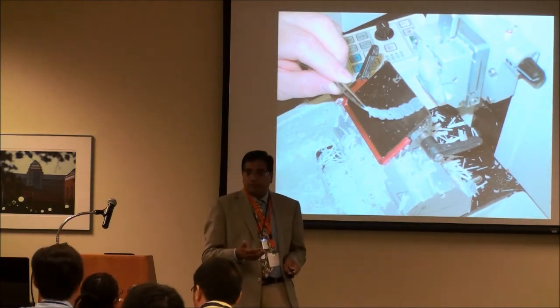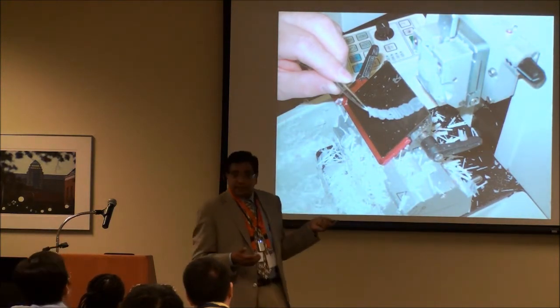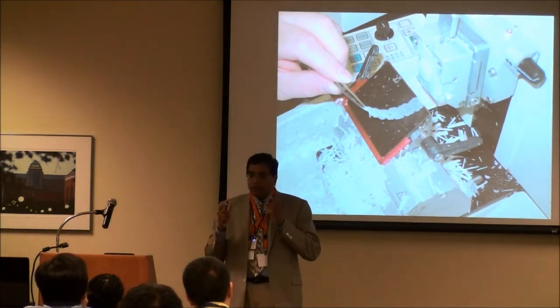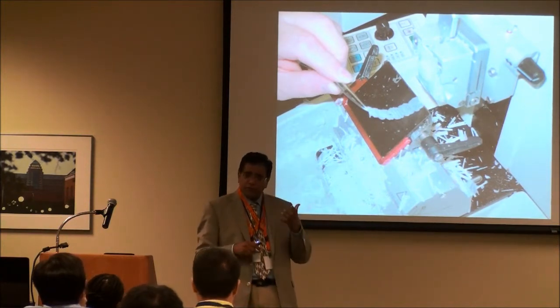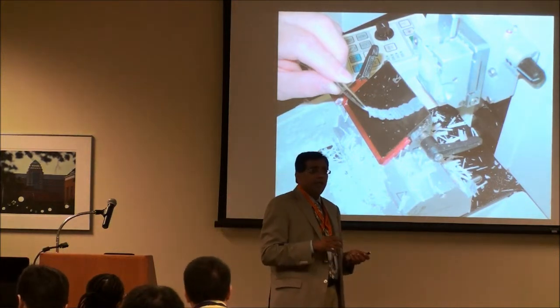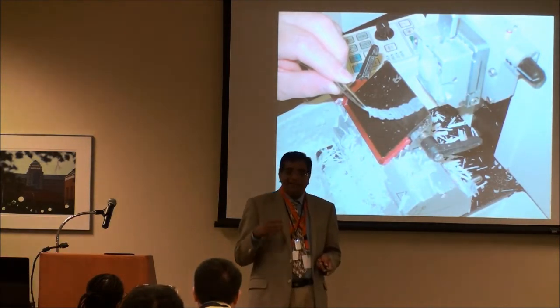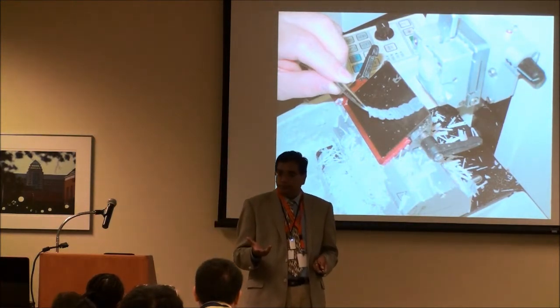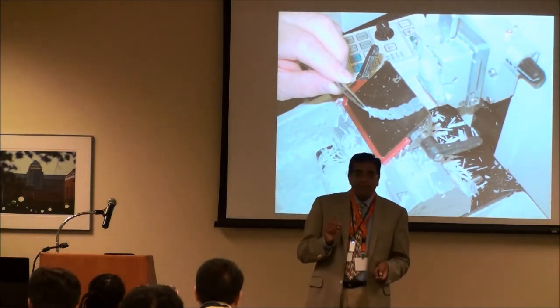Do your technicians have to wear masks when they're doing this? No, they don't have to wear masks, because when we get the tissue from the operating room, if it is not for frozen section, it comes in formalin. If it is for frozen section, it comes fresh. Formalin is an agent that kills pretty much all the microorganisms. All infectious diseases are killed except prion disease.